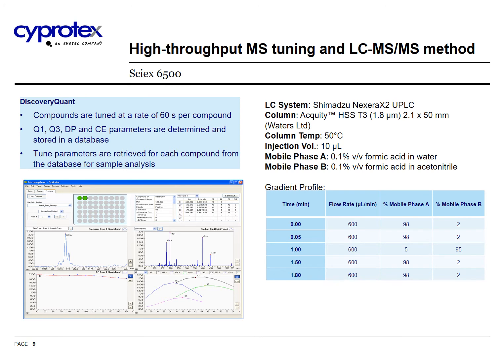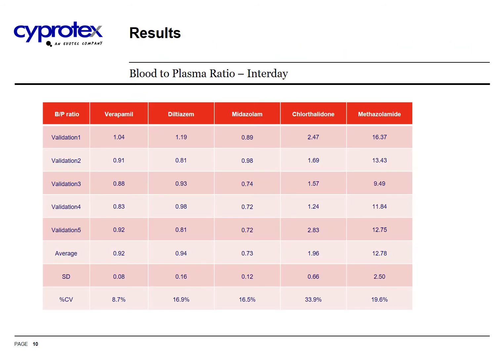The supernatant collected using Bravo from centrifuged plasma fraction with acetonitrile containing internal standard are analyzed using our generic conditions on C18 column. These are the results from the experiments done on different days to determine interassay variability. The results from interassay variability experiments are outlined in the table below.